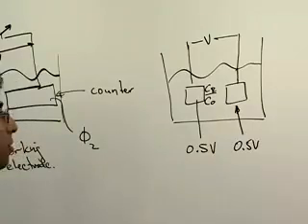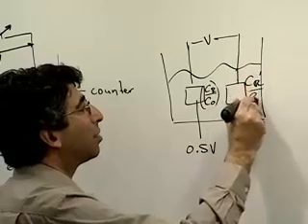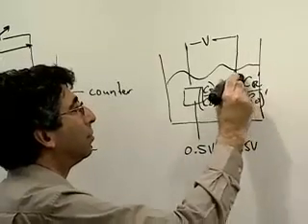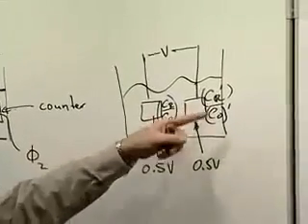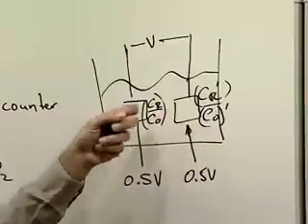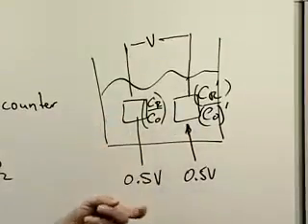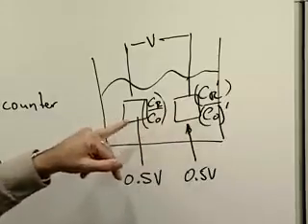Is at these two electrodes. So the quantity at this interface and the quantity at this interface are different. And of course, the Nernst equation tells us that if we have different oxidized to reduced, we have different potentials. So these two potentials at these two interfaces are different. So this experiment only works before you start it. And as soon as you pass any reasonable amount of charge, you no longer have that situation.